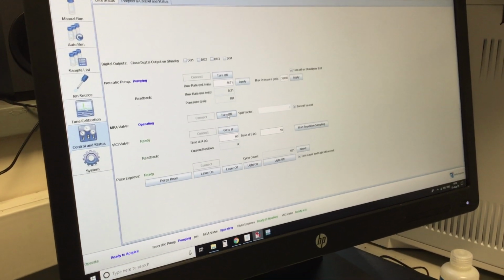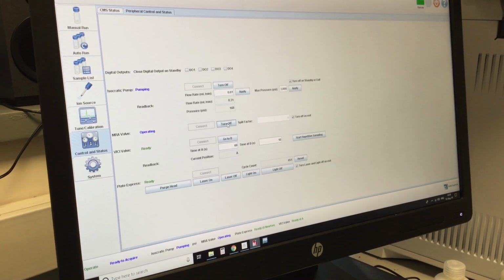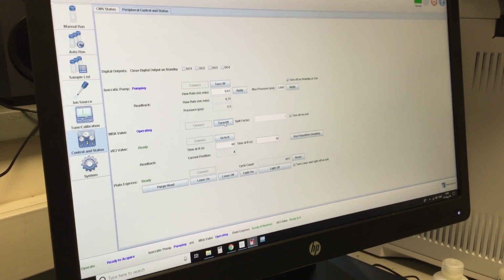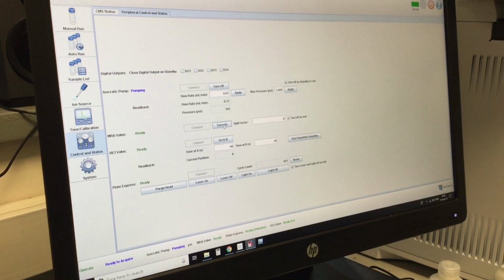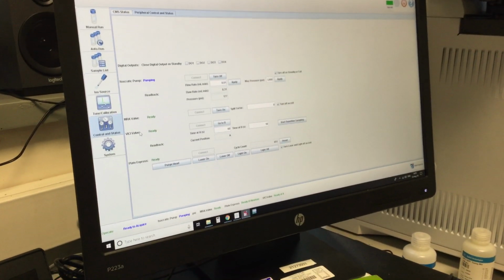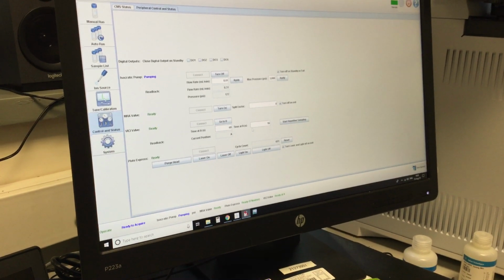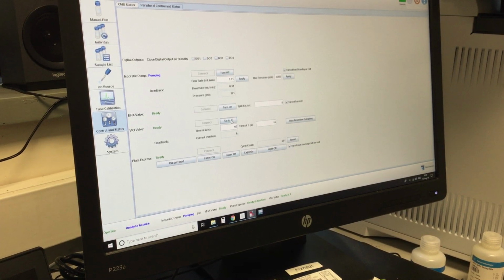There's also different groove sizes that it uses, so it might be slower, but it might be using a bigger groove size. So that's why you need this table. I'll leave it at that. I'm going to turn that off for now. And then for the Vici valve, you have to decide. So you can run this manually.